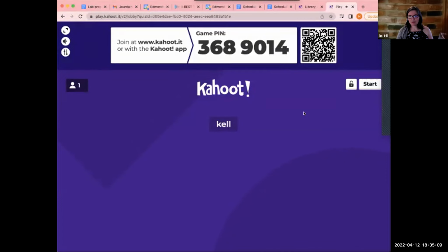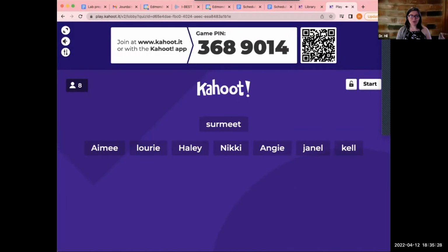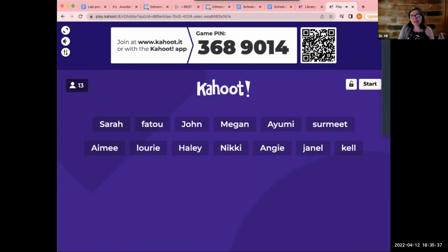Ayumi, while people are logging in, I'll answer Ayumi's great question in the chat here. Ayumi asked if I forgot the mordant, or the alcohol, what would the color be? So it's two separate questions. If you forget the mordant, then the stain won't set in the gram positives, and it'll get washed out of everything, and then the counterstain will stain everything, so they'll be pink. If you forget the alcohol, which is the decolorizer for gram negatives, everything will be purple at the end.